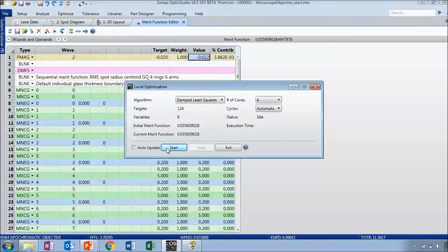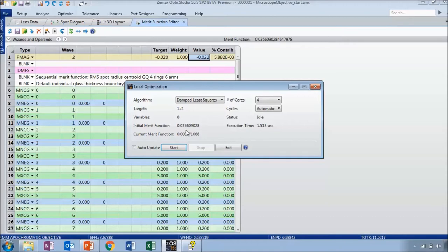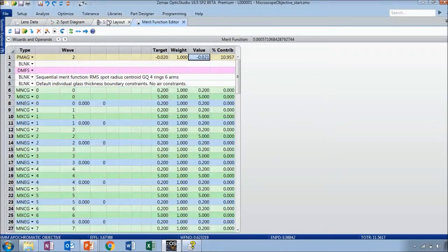Now I'll run the local automatic optimizer. This is automatically varying the values of all the radii of curvature which I set to be variable, and each iteration attempts to drive the overall value of the merit function to 0. This is called a local automatic optimizer because it automatically stops when it believes it's found a minimum value — in this case a local minimum. Very quickly, under two seconds — about 1.5 seconds — the merit function was significantly reduced.